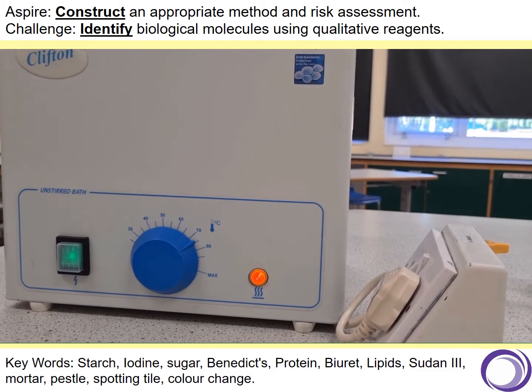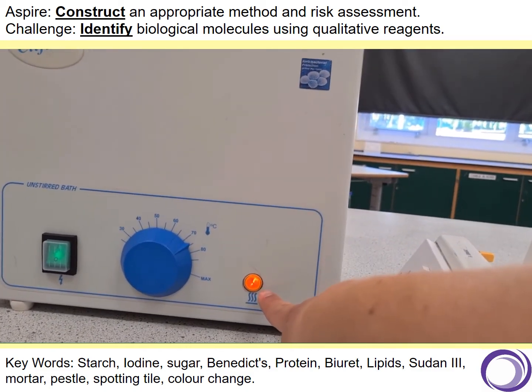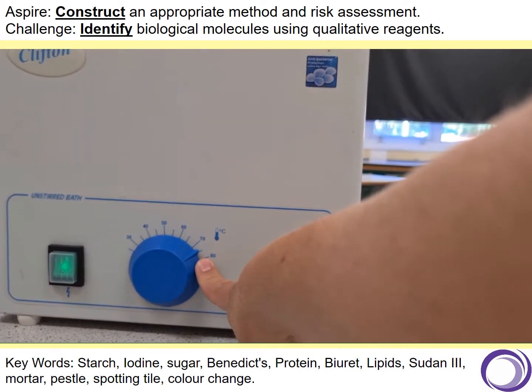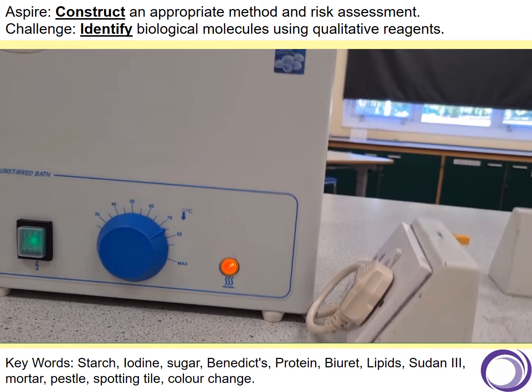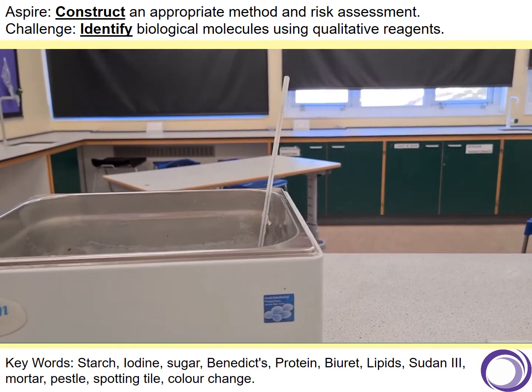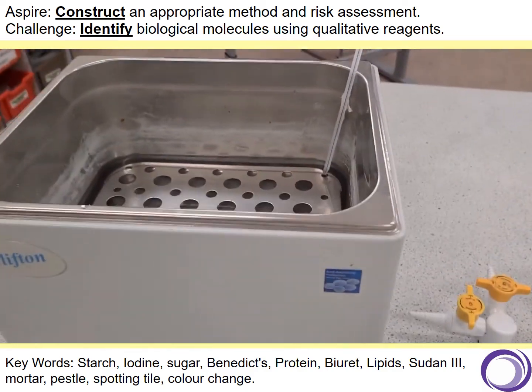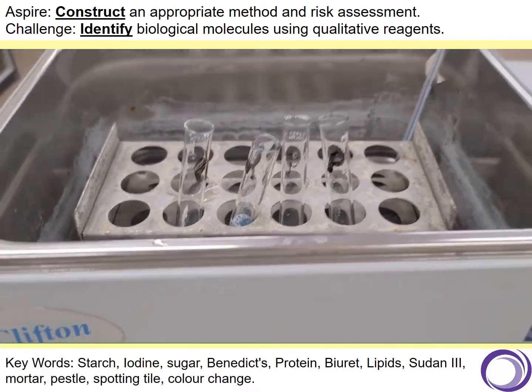You see that switch is on now here. Okay, this light is on here, saying that it's going to heat up. But once it gets to the required temperature, in which case here it's 75, then that switch will turn off. I've got a thermometer in there just to make sure it's working, and I can put my solutions into this hot water bath. All right, and they will heat up.